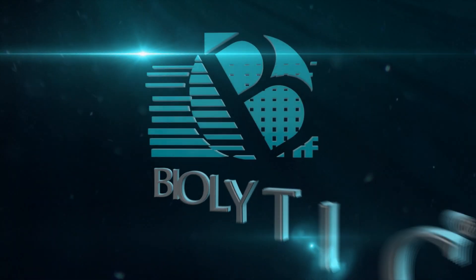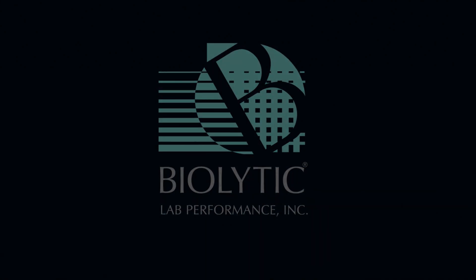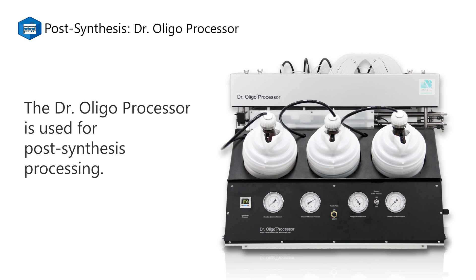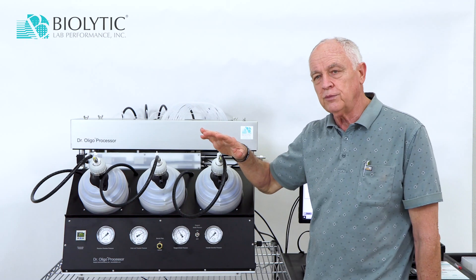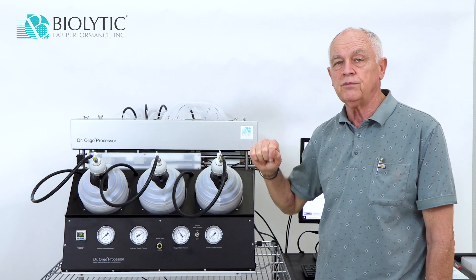Hello, I'm Tom DeMitt and today I'm going to show you the Biolytic Dr. Oligo Processor. The Biolytic Dr. Oligo Processor is used for post-synthesis processing, and the way it fits into the overall scheme of synthesis is elute, collect, and then do oligo purification using an oligo purification cartridge, sometimes referred to as DMT-on purification.